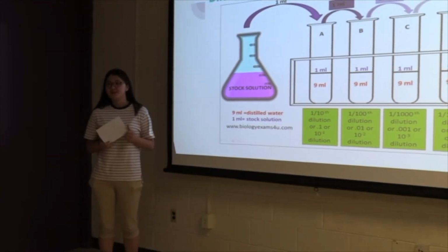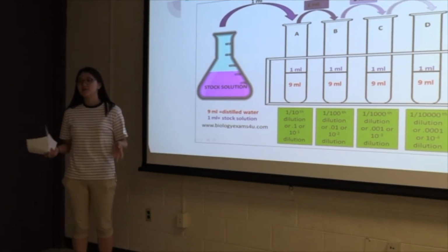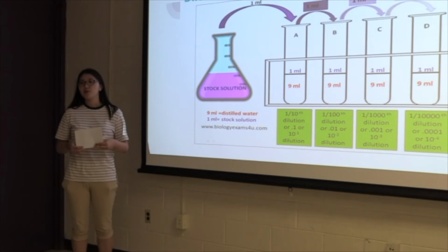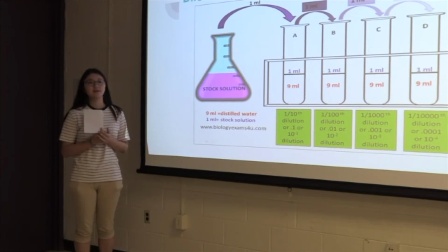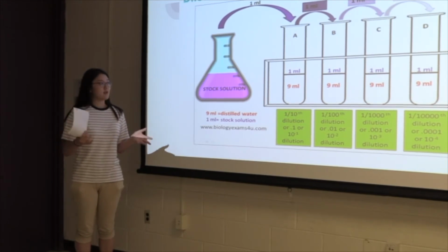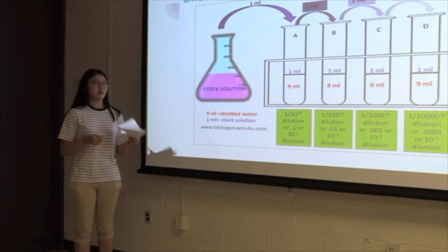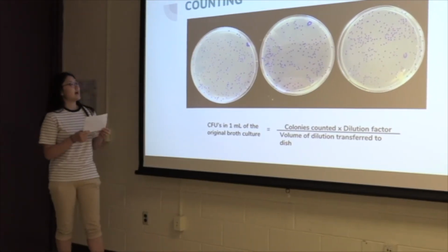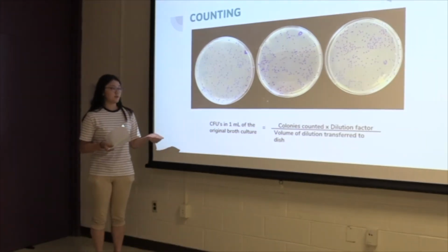So this is how we do dilution. We take 500 microliters of yogurt and then transfer it to the first test tube to make 10 to the -1 dilution. And then we repeat the process until we dilute up to 10 to the -5 or 6 or any factor that we need to make. Then we transfer a small amount of each solution to the plate, and then we incubate them for 2 or 3 days to see the bacterial growth. This is how we count with the markers, and after we count them, we calculate the CFU using this formula.